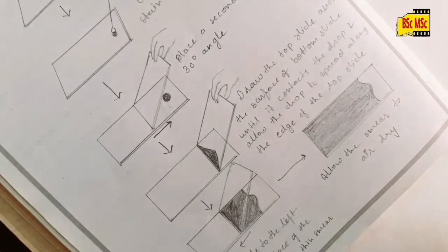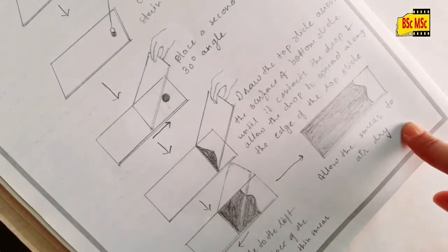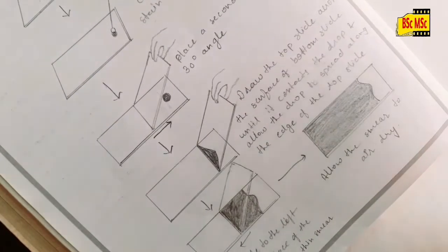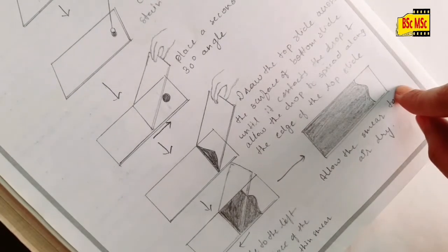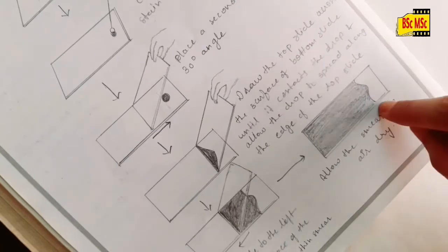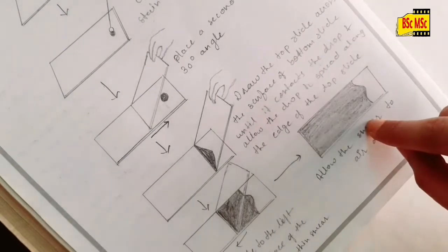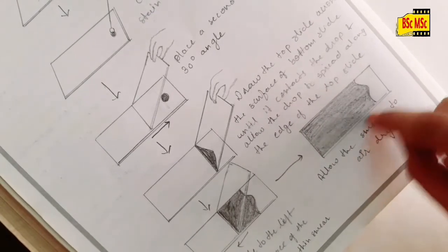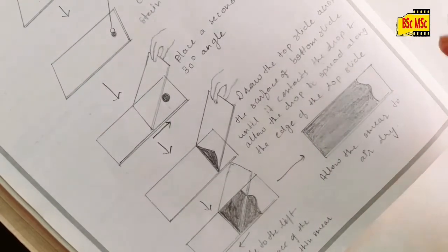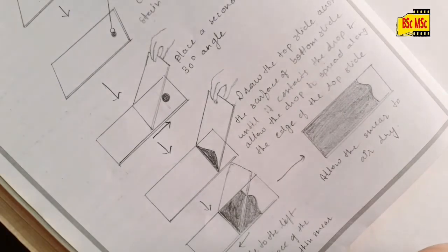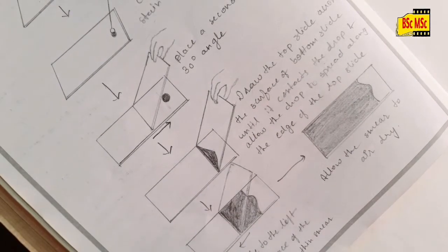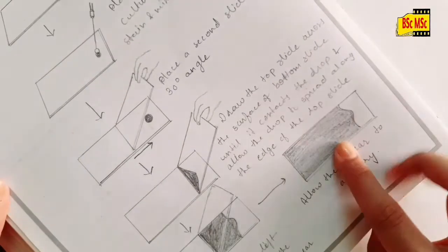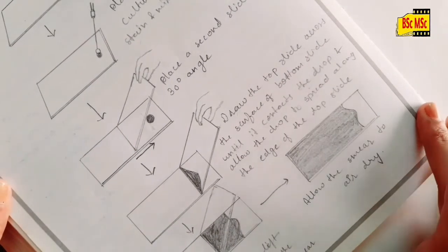When we do negative staining, because the dye is negatively charged and bacterial cells are also negatively charged, that's why under microscope the bacterial cell morphology appears transparent. Now you need to observe under microscope.